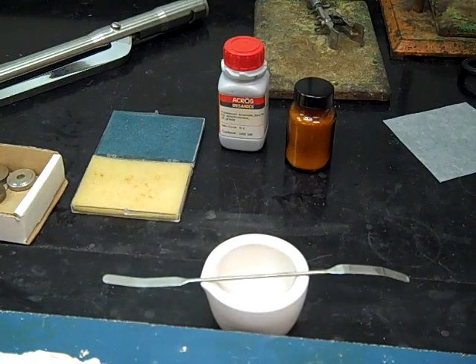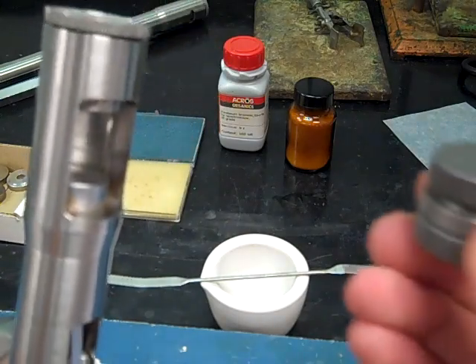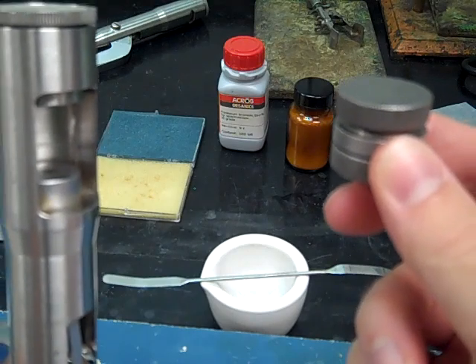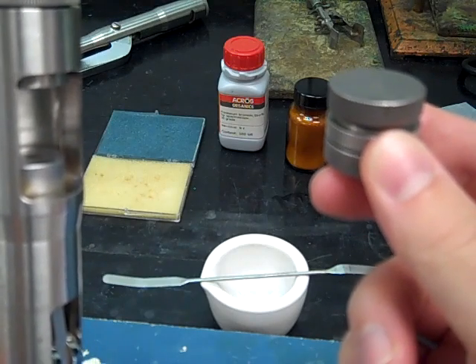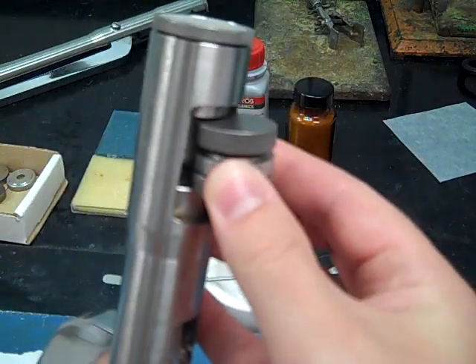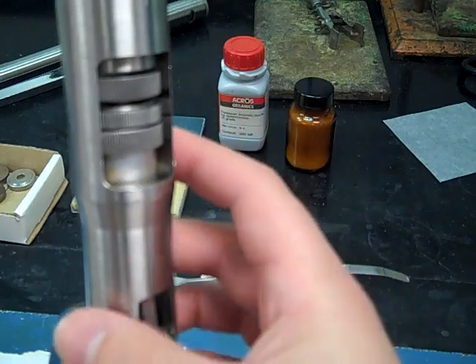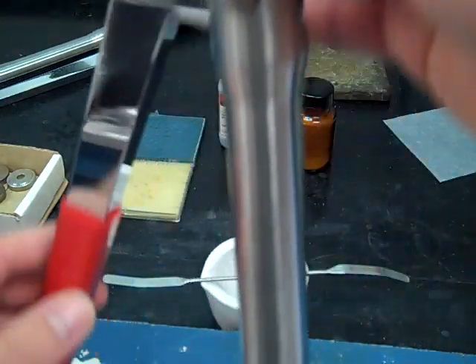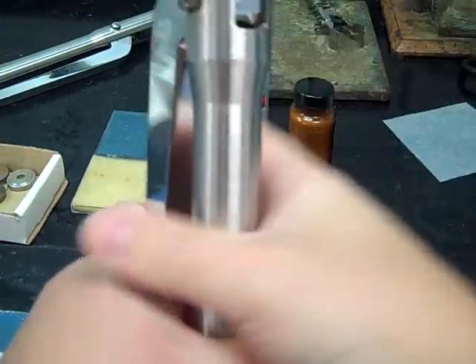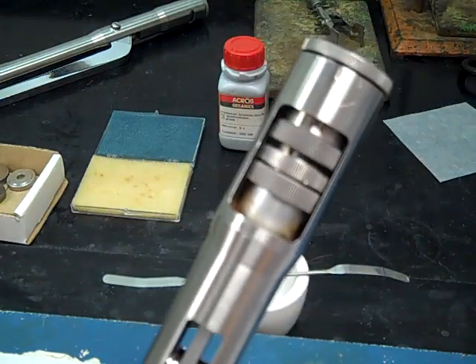So you take one of your pellet presses, so here's one, you can see the opening there, and then you're going to support this by the bottom of the die set. If you support by the top, it's going to pull out, so make sure you support by the bottom, and then you're just going to slide this into the pellet press. Once you get that inside the pellet press, this handle should squeeze together so that there's a little tension, but eventually it squeezes all the way in.